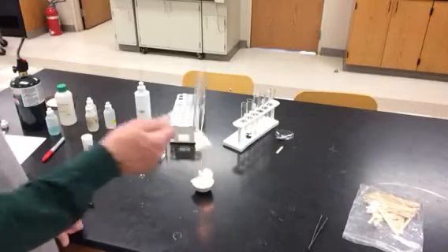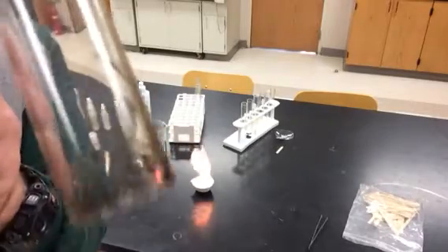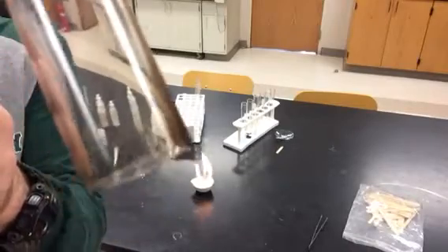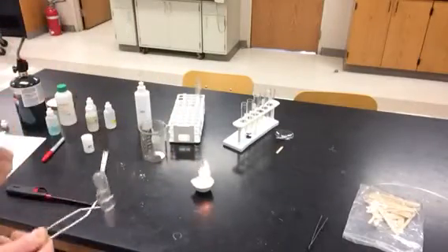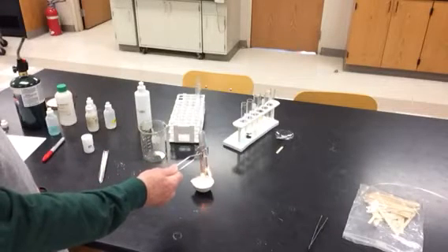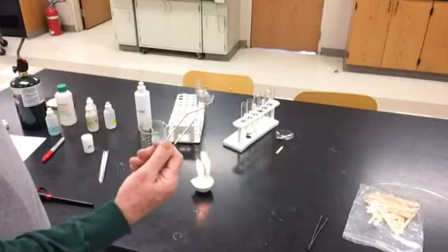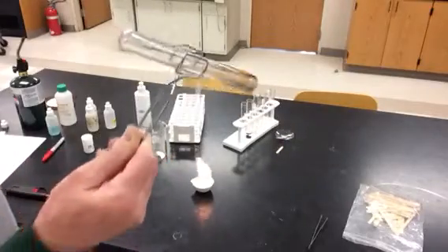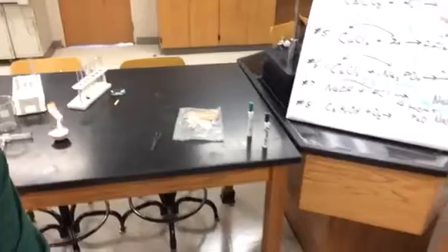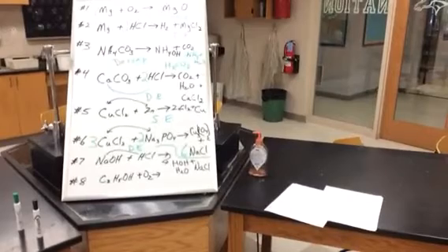We can also start to see down at the bottom of the test tube, see how it's starting to get kind of darkish black? That indicates I've got some incomplete combustion going on. So one of the things that we'll look at here in just a second is what combustion products make. Okay, so let's go back over to the board. I'm going to be careful not to back into that because I still got a lot of alcohol burning there yet.